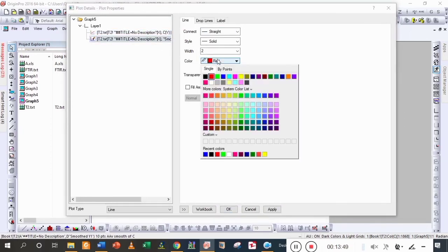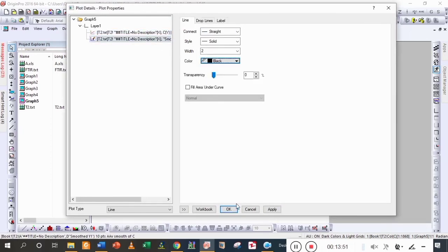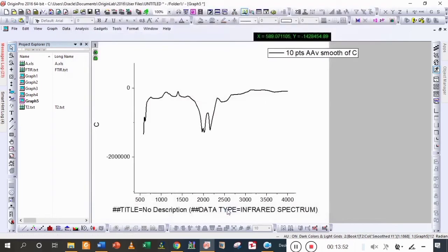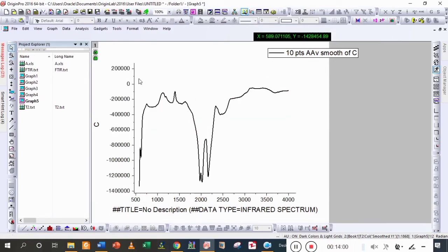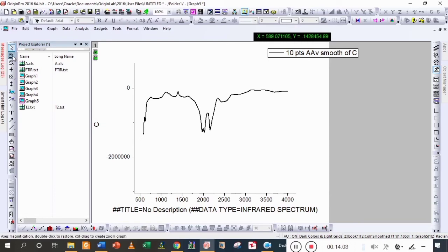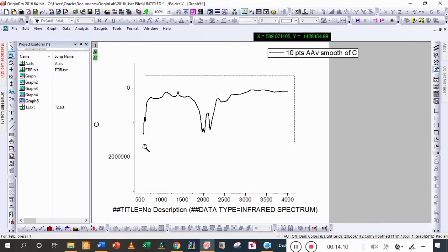Now I'm going to change its color. Here a standard data is observed, so I'm going to zoom it. You can see that the peak values are too high, so I'm going to change it to a smaller zoom ratio.